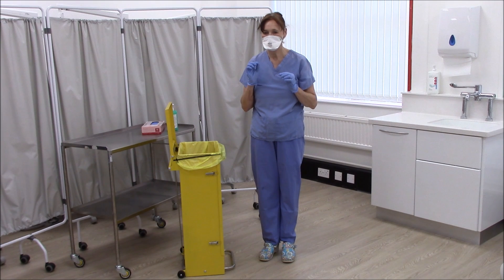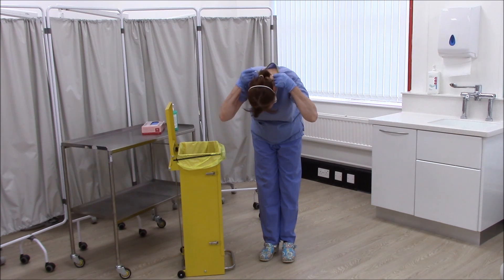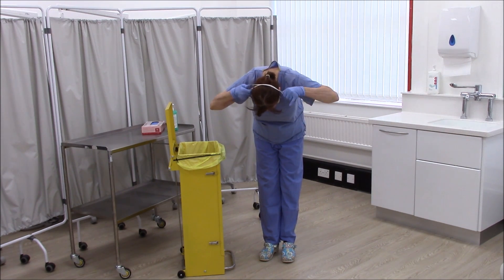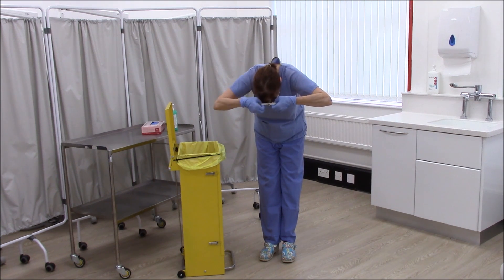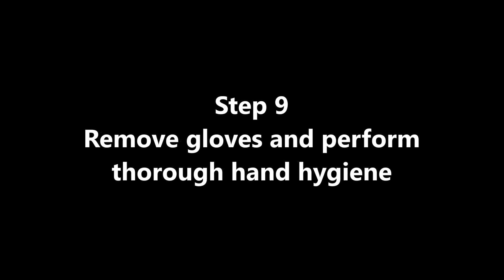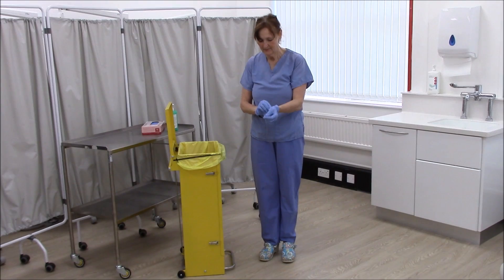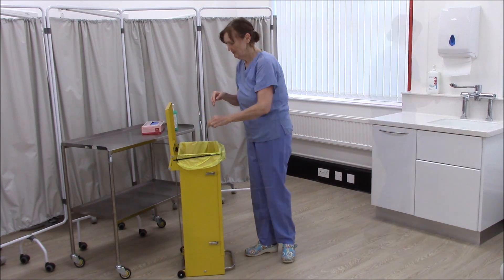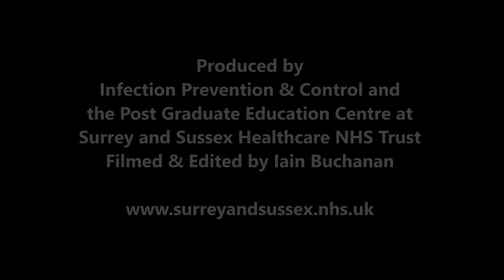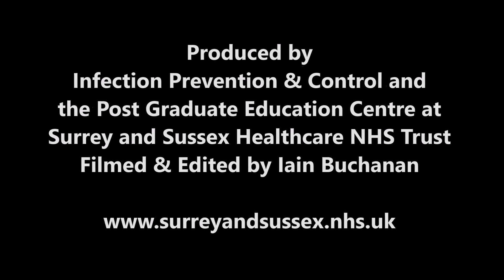To remove your FFP3 mask, lean forward and grasp the securing bands from the back of your head, lifting them over your head. Pull your FFP3 mask away from your face and discard it directly into the clinical waste bin. Never touch the front of the mask.